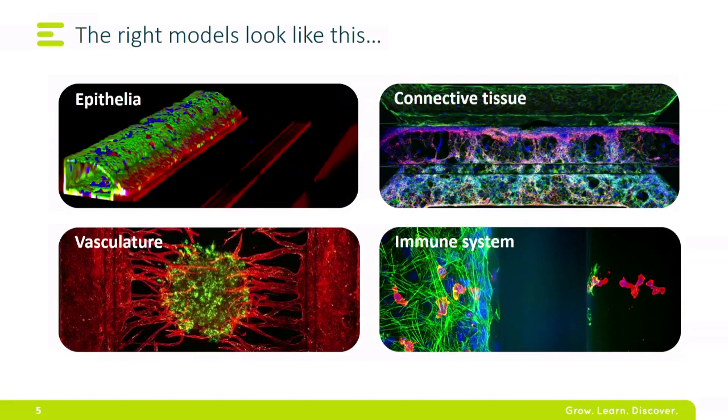And then there's of course the vascular component, right? So vasculature, typically the way to study vasculature is to either in isolated fashion or graft it into mice.